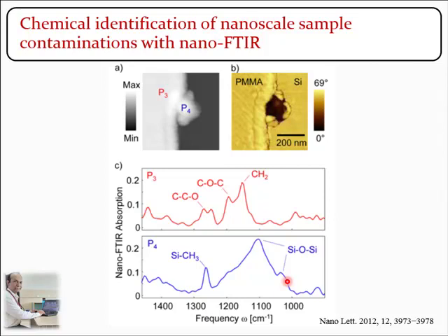The appearance of these spectral lines is typical for PDMS, that is polydimethylsiloxane. We can thus identify the particle-like features as a PDMS contamination. We note that the sample preparation and the pre-characterization involve PDMS material, obviously leaving PDMS residues on the sample surface.